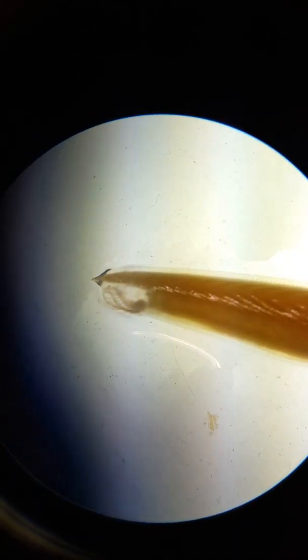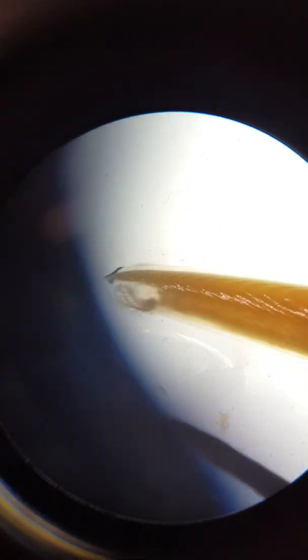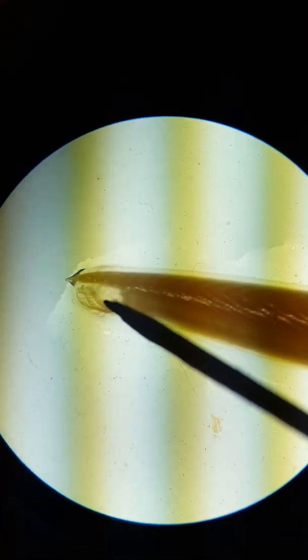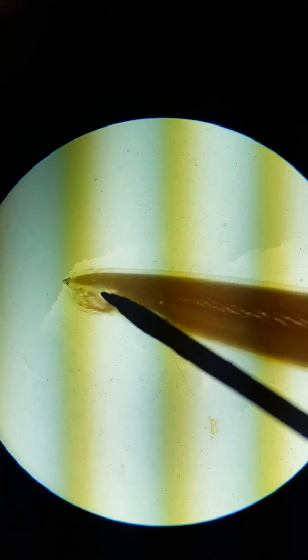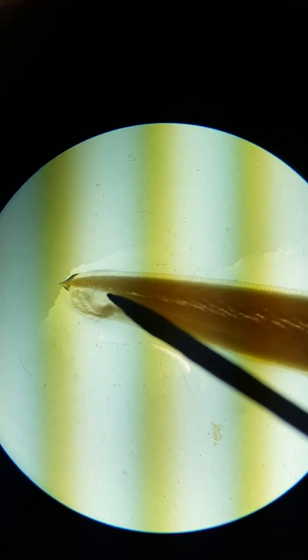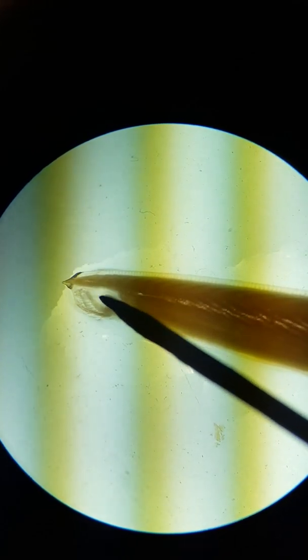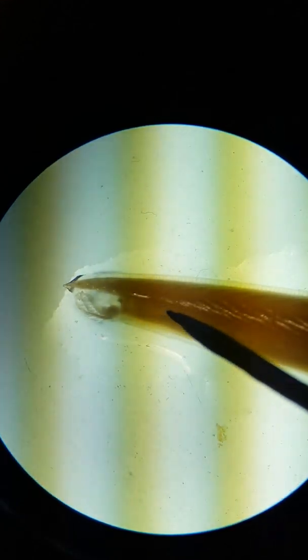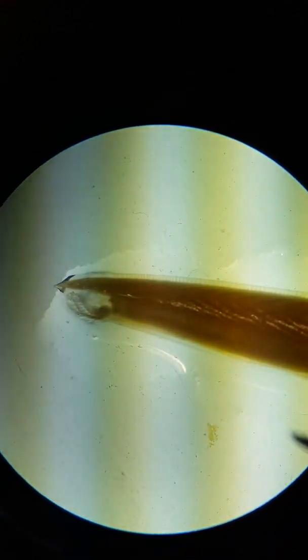So this is all just an opening. You can see it moving three-dimensionally there, it's a round opening, and that clear part is that buccal cavity, the vestibule, and the vellum and the mouth are in here, and the pharynx is in the thicker part.